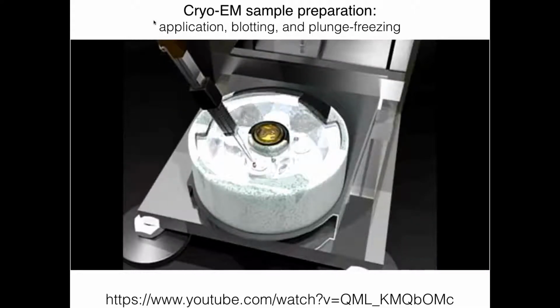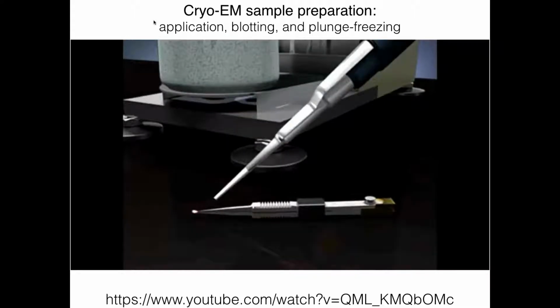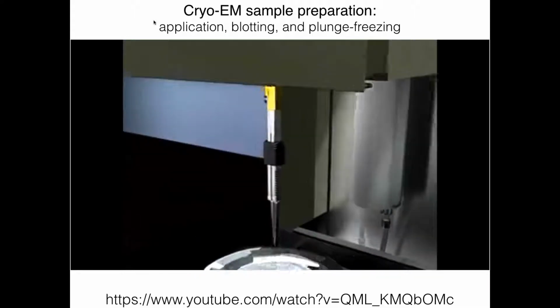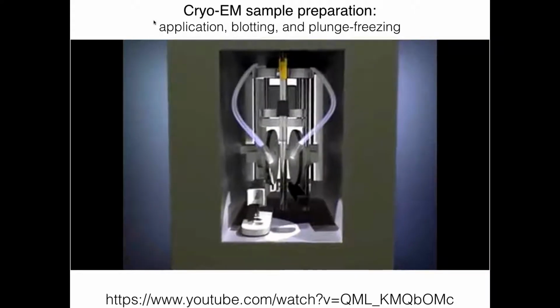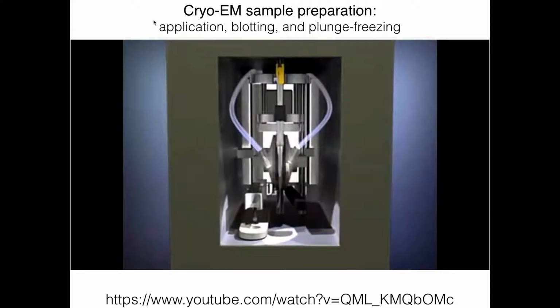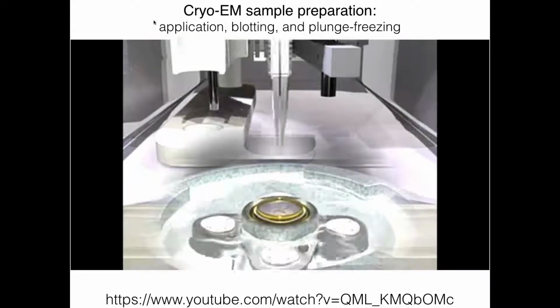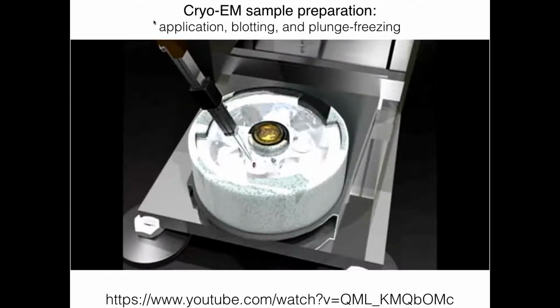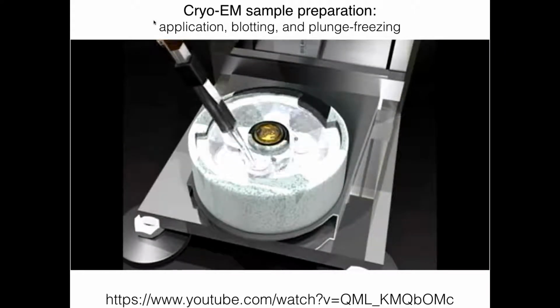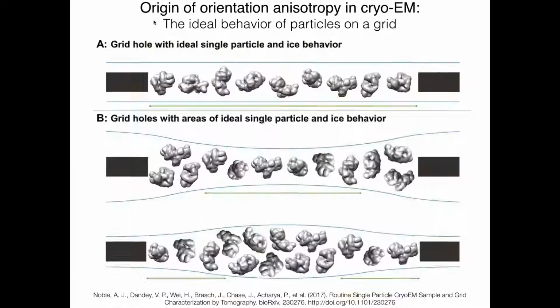So 99.9% of that sample is discarded. You're using a big giant piece of macromolecular filter paper. If you ever look at a filter paper under a microscope, it's not a smooth thing, right? So you're using this big giant piece of filter paper, and you're expected to get really thin ice that is 20, 30 nanometers in thickness. This is not a good way of making specimens, but it works.